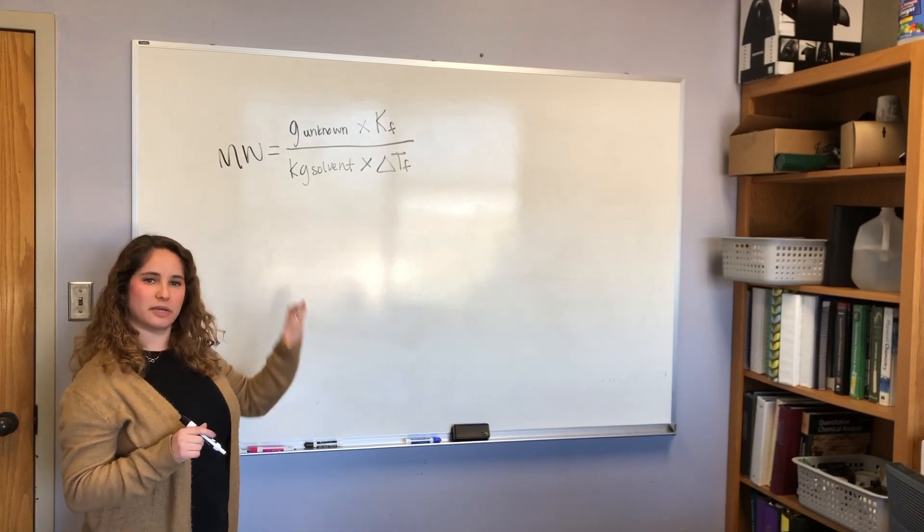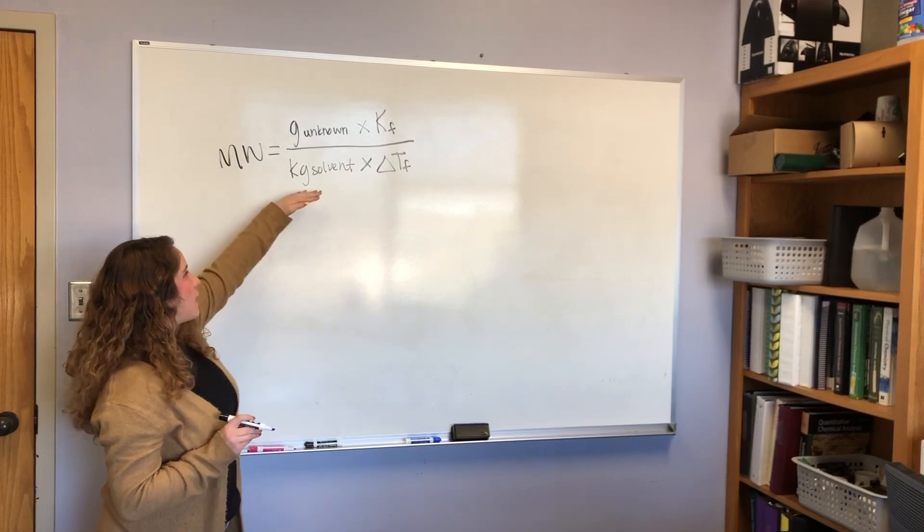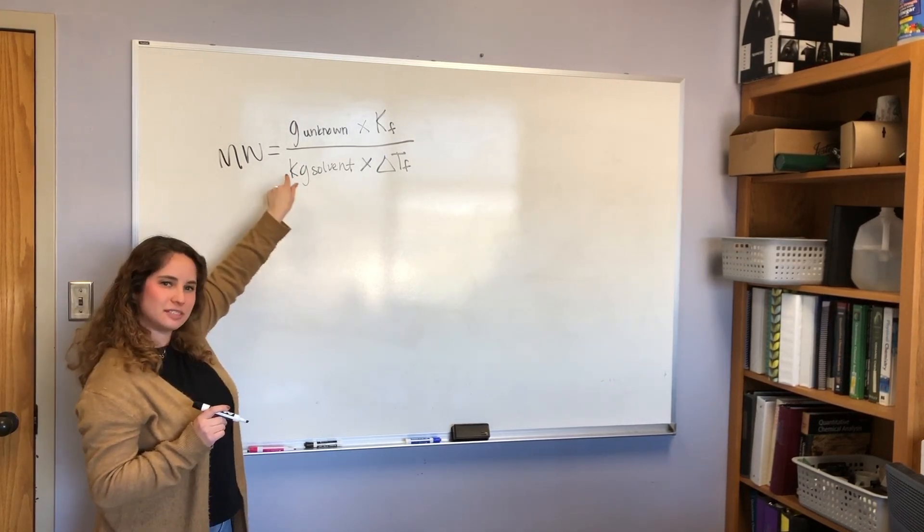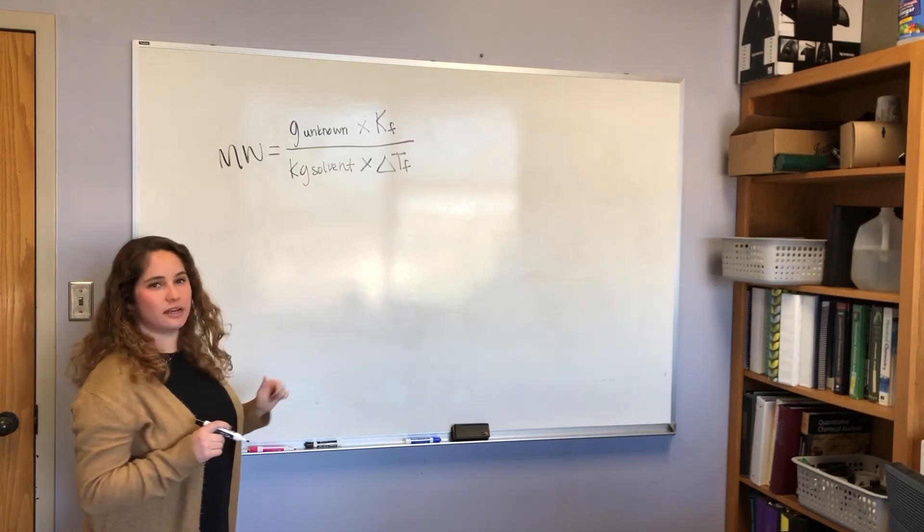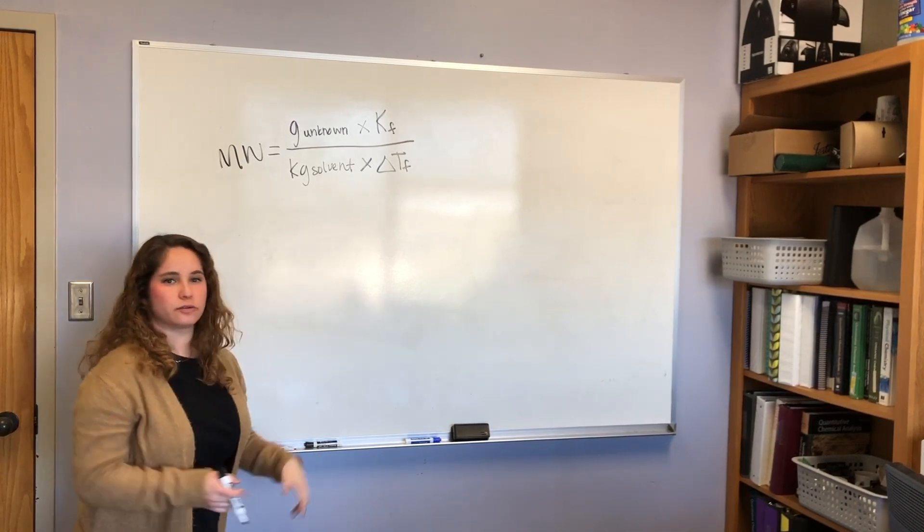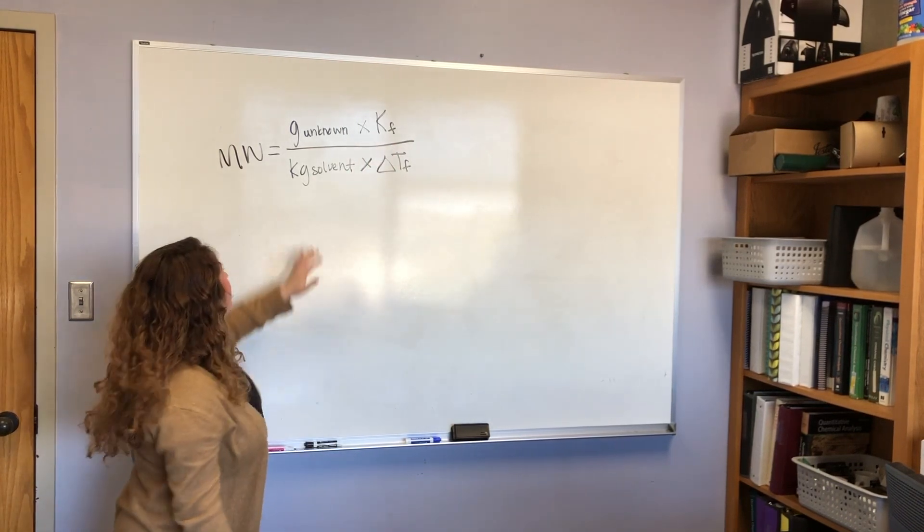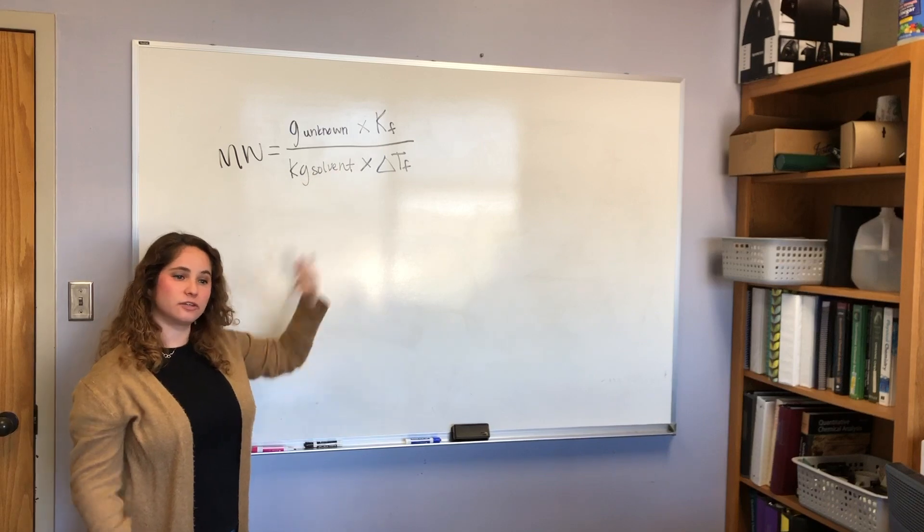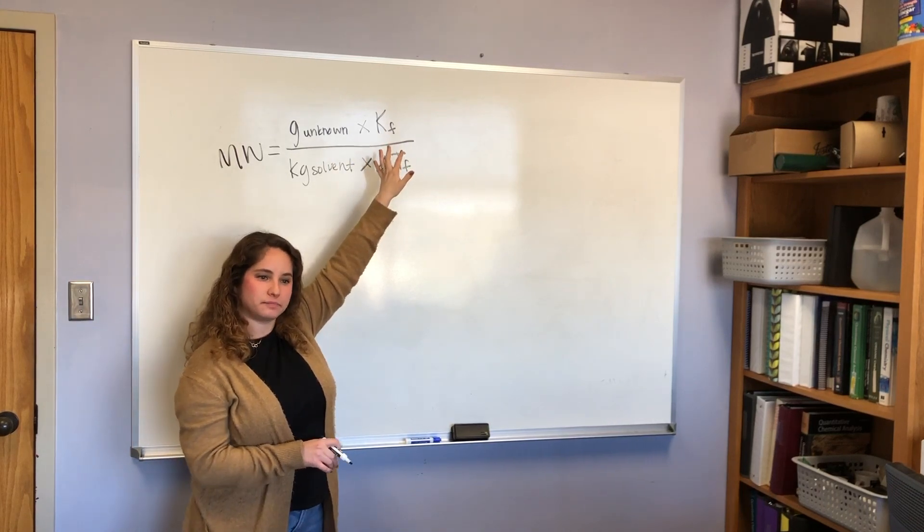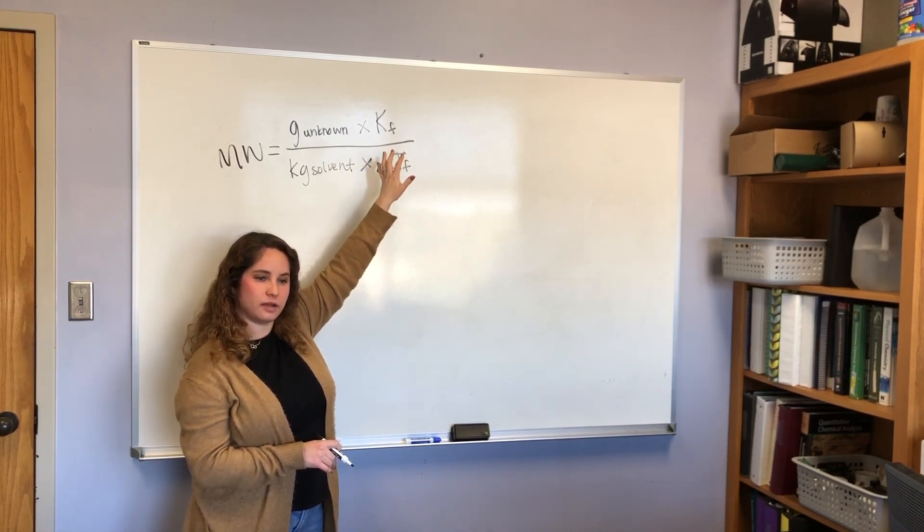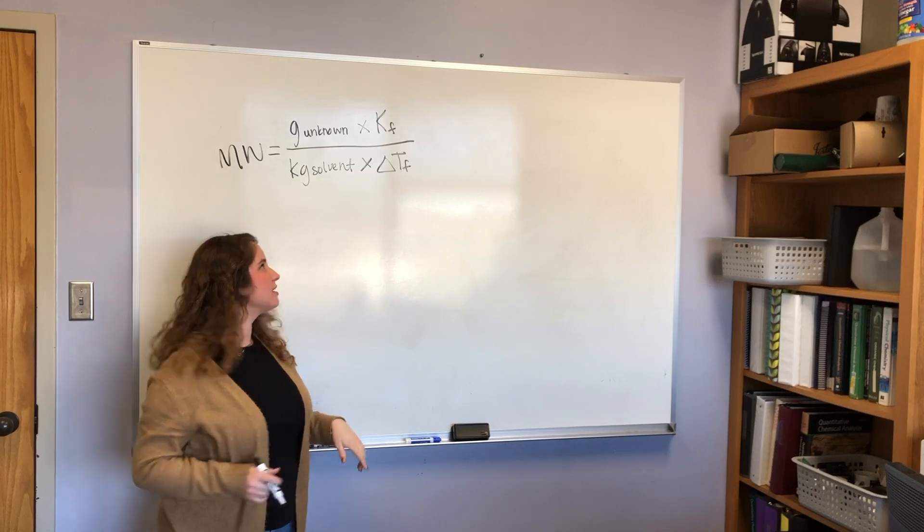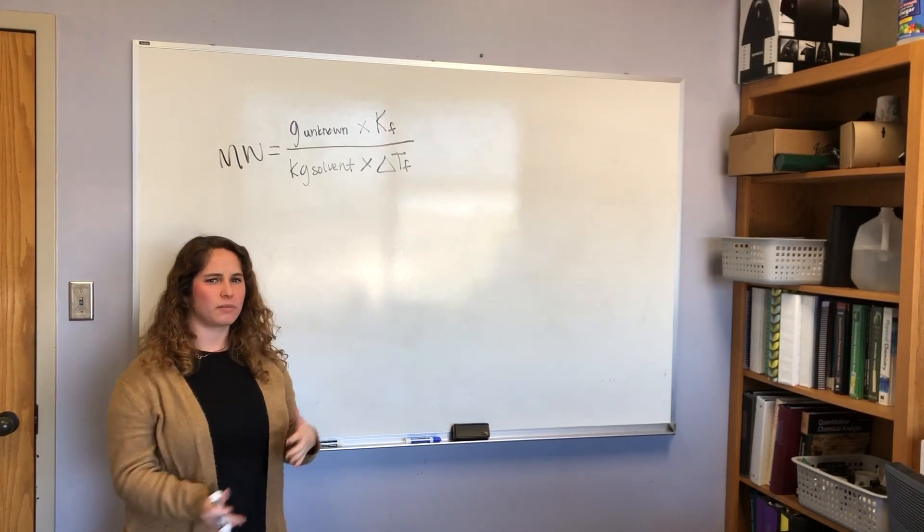The other main mistake that students make is instead of converting their solvent to kilograms, which is actually outlined in the data sheet, it has you measure in grams and then convert it to kilograms. If you accidentally use grams of solvent, you're going to have a number down here that is 1,000 times bigger than it should be, which means your molecular weight could end up being a thousand times smaller than it's supposed to be. So those are the two main areas where students really mess up because this is a constant, it's provided to you, and this is just a number that you got off the scale. So usually that goes pretty well for most people. The KF is actually provided at the end of the experiment.